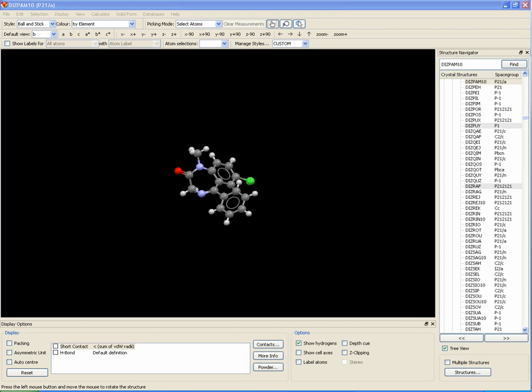In some cases, the published crystal structure of a compound may be reported using a non-standard space group setting. In the example we are looking at, the space group setting reported is P21/a, which is a non-standard setting of space group 14. The standard setting is P21/c.